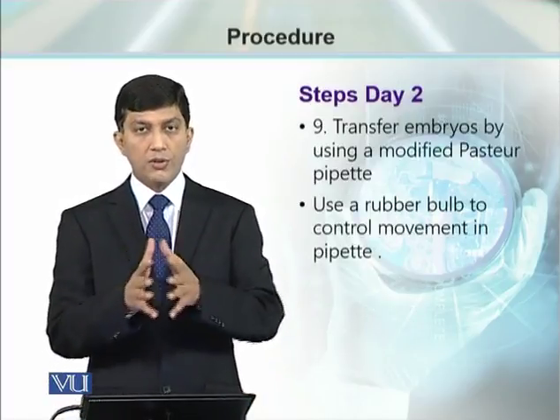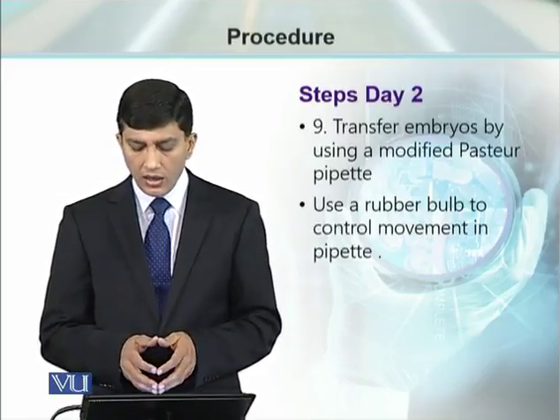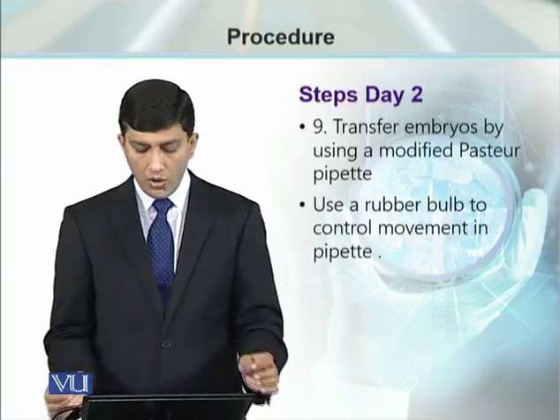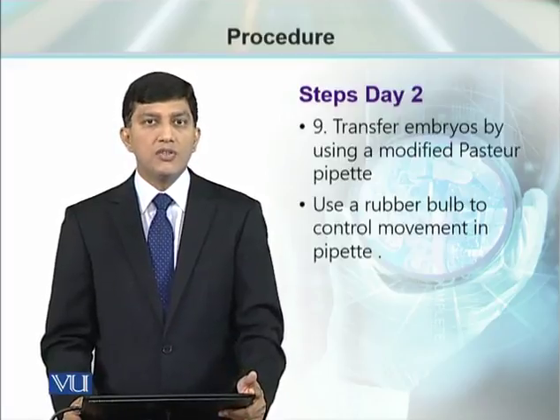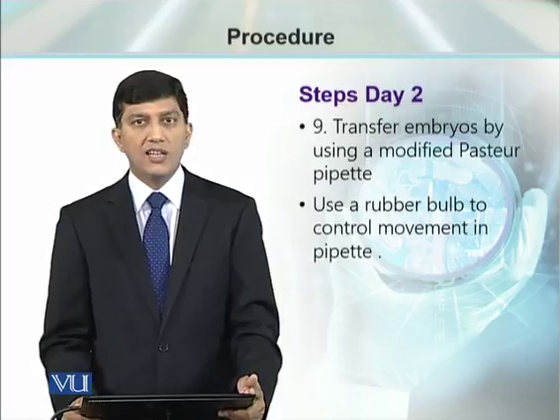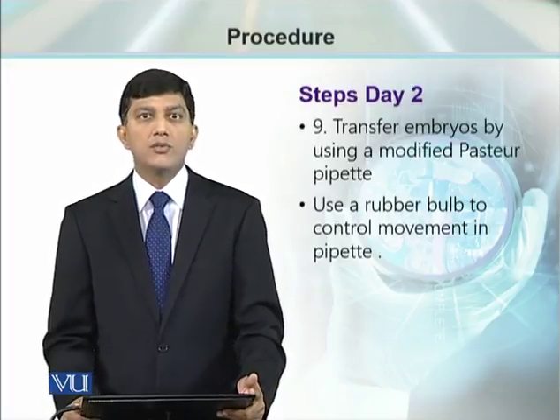Once this process of collection of eggs is completed, we can proceed further with the transfer of eggs using a modified Pasteur pipette, just like a dropper which picks up these eggs, and proceed to the transfer of these eggs for the process of microinjection of the DNA.